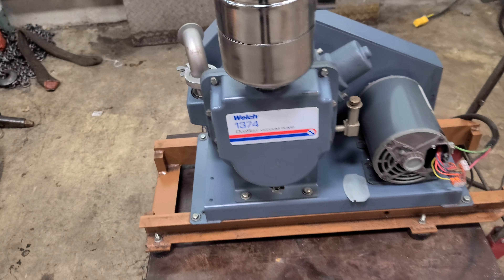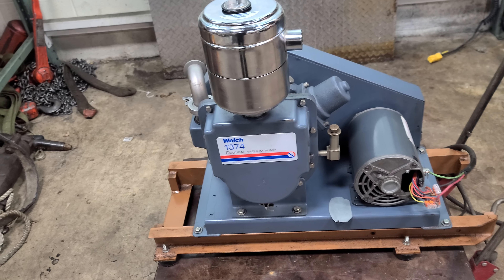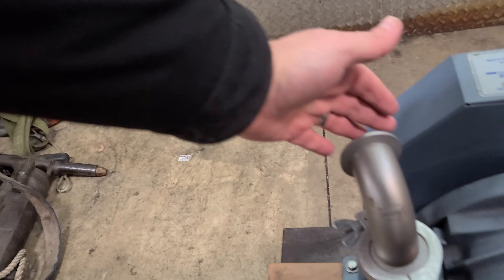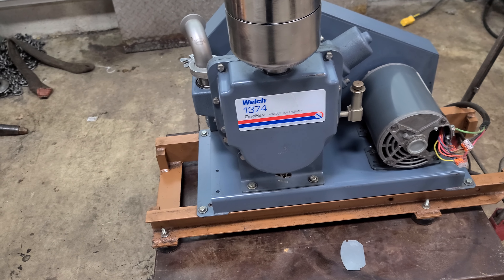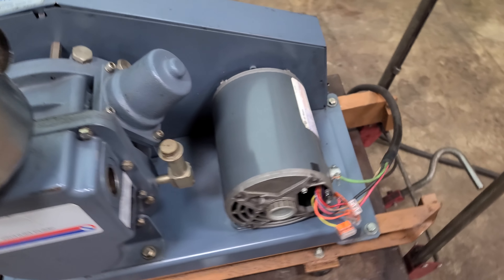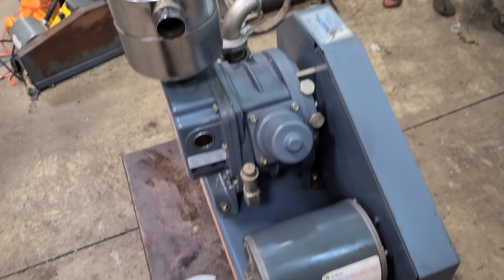I'll let you hear it run. I'm going to say it needs a rebuild — but maybe I'm wrong. Could be something simple, I don't know. I'm not going to get into it, but that's the unit. If you have any questions or concerns, let me know. Thank you.